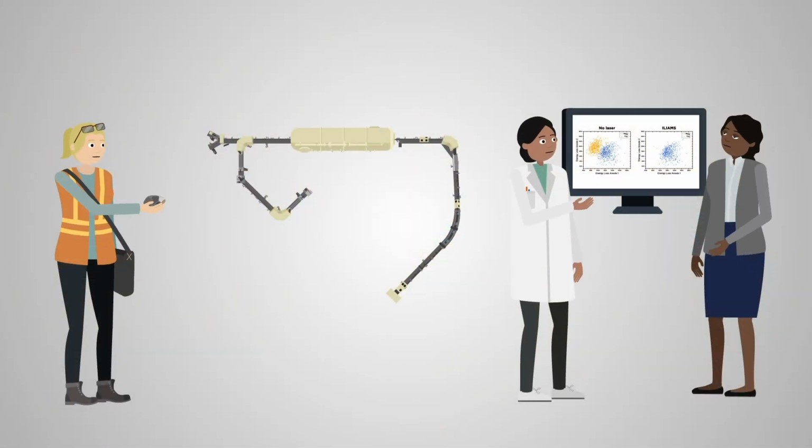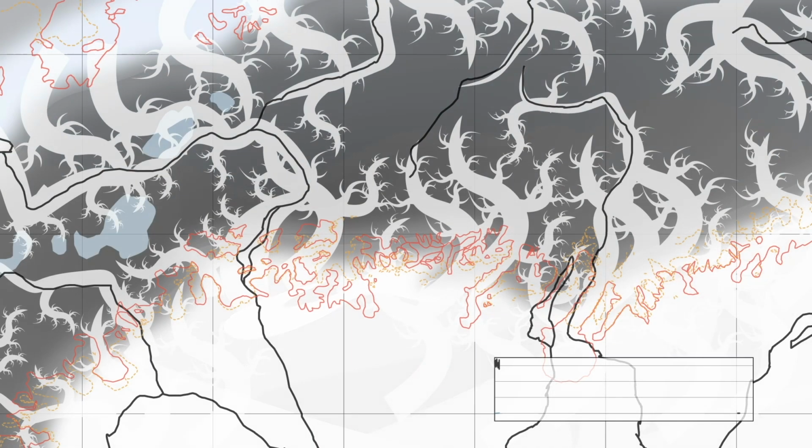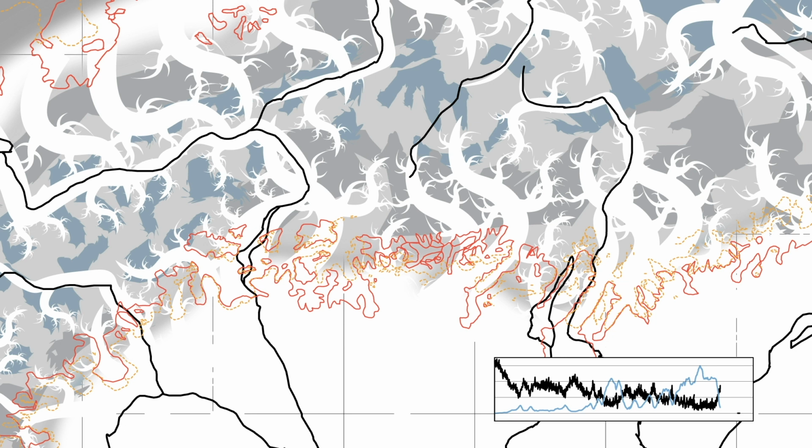Classical AMS and ILIAMS provide ion concentrations from samples, but what do the results tell us? In practice, scientists can use radionuclide concentrations to reconstruct the effects of glaciers in the past, shed light on the impacts of modern climate change on ice sheets, and predict how climate may alter glaciers in the future.